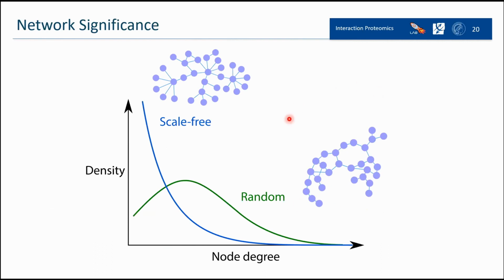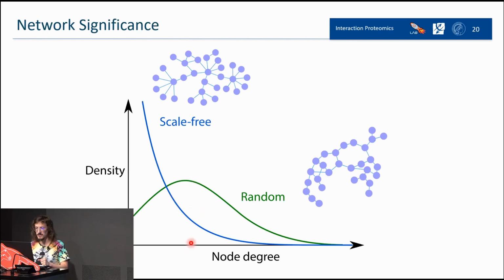When you have a random network, something like this one, which is not representing any biological effect and is just a random mix of edges and nodes, usually when you randomize something you get a kind of normal distribution. So here the top could be 2 or 3 interactions per node, and then the further you go, the more they reduce. There are few nodes with just one interaction, and few with a lot of interactions.